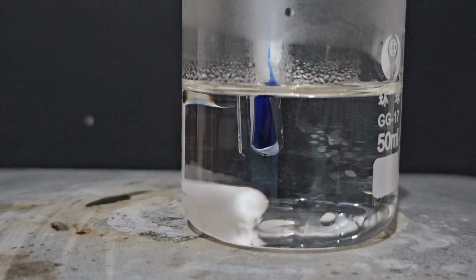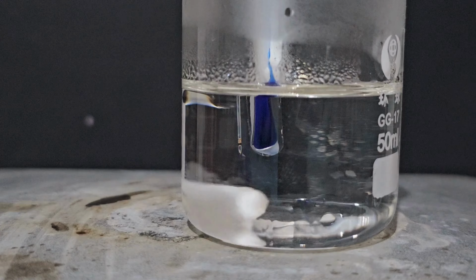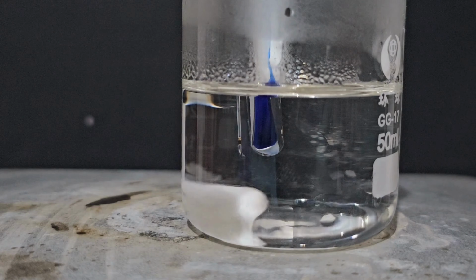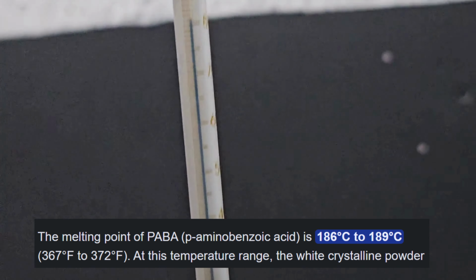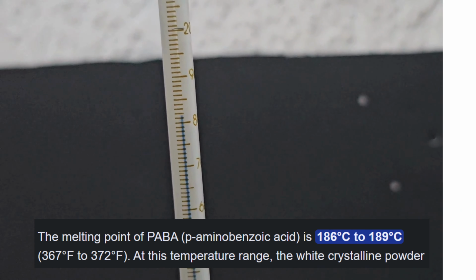To finish the experiment, I took the experimental melting point of the sample, and it resulted to be between 181 and 182°C, which is not very far from the theoretical value, but significantly below.